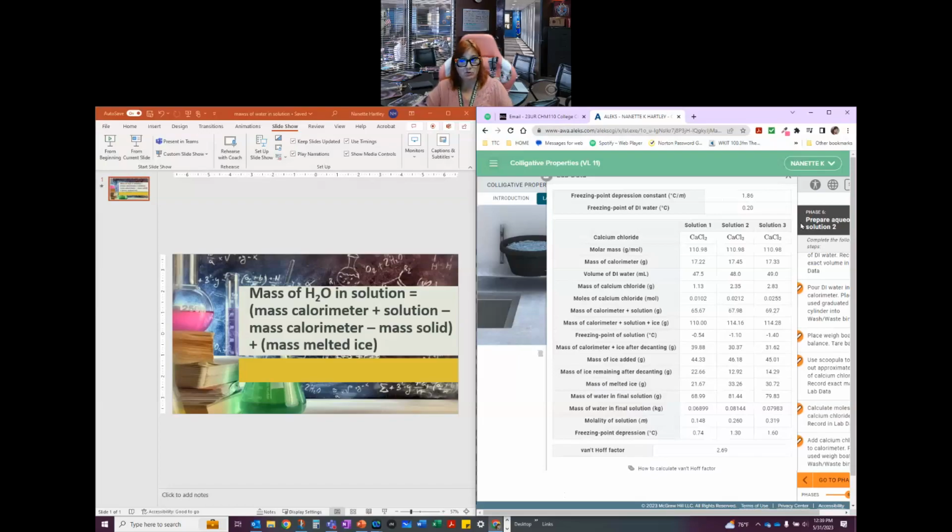Just follow the instructions as they're written. Make sure you do everything it says, because otherwise it's going to call you out on it. Like if you forget to put the calorimeter in the waste container, it's going to say, "Hey, wait, you didn't do that." So make sure that you've done everything. This is one of those ones where as you go through each step, it does not check it off. It only does it when you try to go to the next phase. So if there's anything you missed, you'll need to go back.